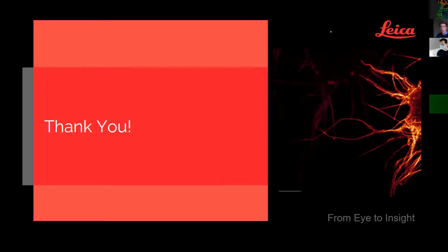So what I mentioned there is that you can reduce your depletion laser power to around a third of the original one, and still get a comparable resolution improvement as you would have gotten with pure intensity-based STED. So that is at a third of the depletion laser power and the same excitation laser power as opposed to pure confocal imaging. You can get a nice resolution improvement in the range that you know from your pure intensity-based STED. If on the other hand you use the same depletion laser power as before, you can push the resolution even more. I don't know if that fully answered your question, but we will also talk about this in the hands-on part a bit more.